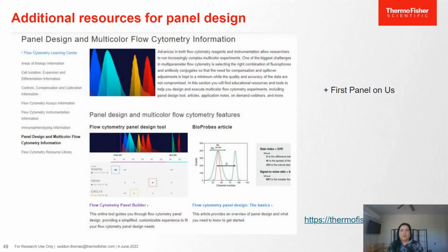And then you still want to, of course, evaluate that using your own judgment. Is it matching the brightness that you need? Is it an unusual fluor where you need to leave space because it's going to be restricted in some way? Are you having to do a conjugation? Things like that. But there are a lot of resources online, so I would encourage everyone to check that out.